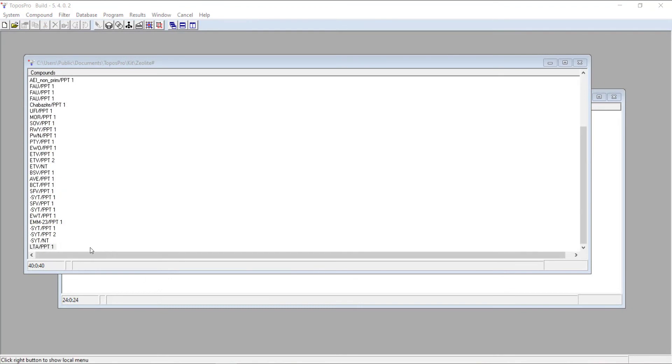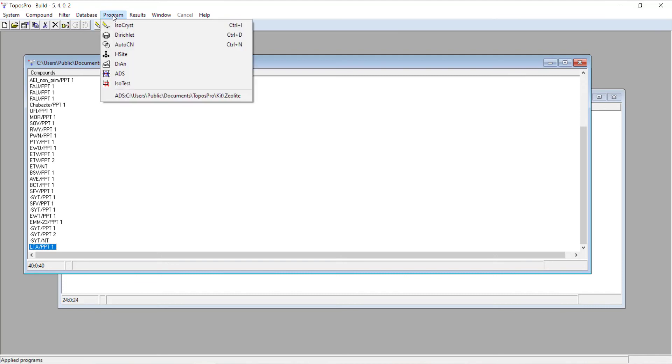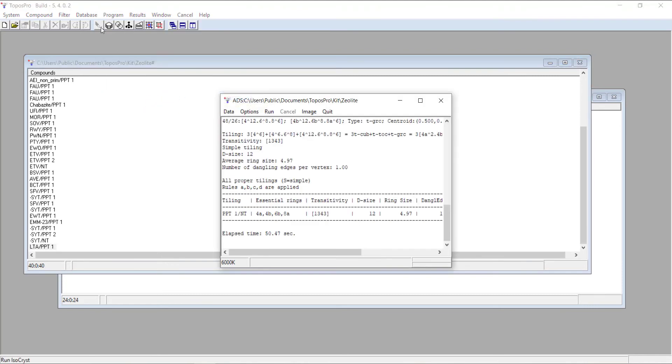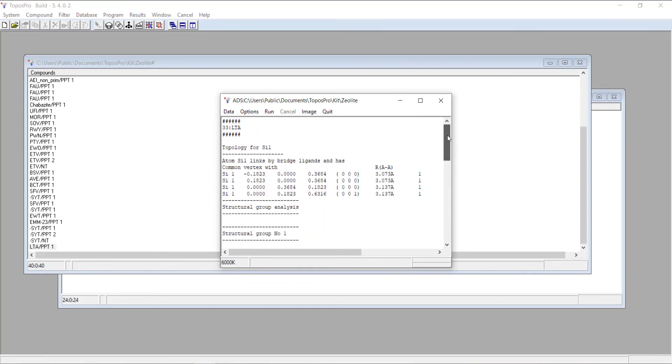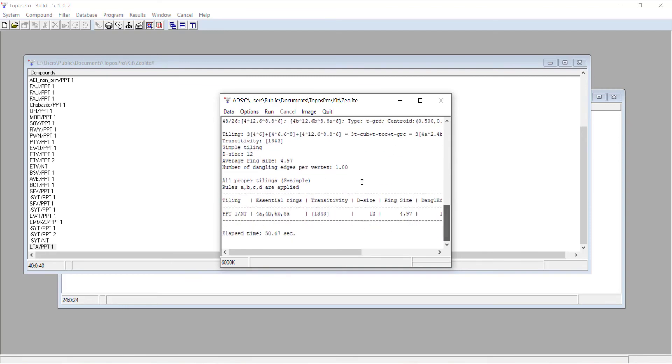After calculating a tiling, you can actually go back to Topos and view the tiles that you've generated. If we go to program up here and click ADS, there will be the result of the last calculation that you ran. If you scroll all the way up to the top here, you can see we've got LTA up there.